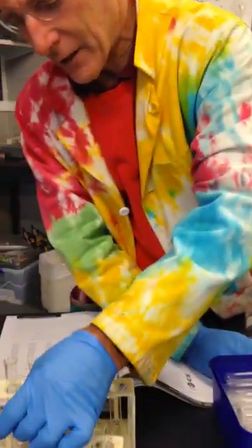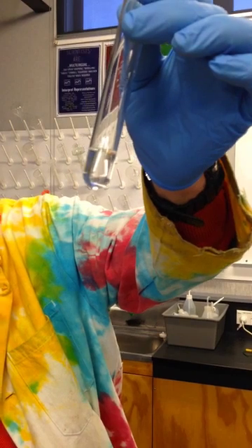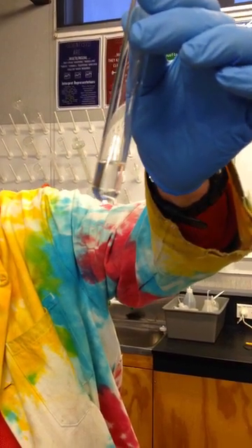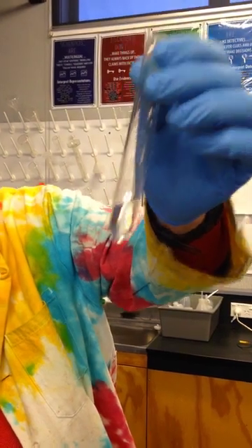The anomaly here is the ethanol. Now, why did we not get two layers here in the ethanol? And try and explain that in terms of the bonding and properties of these substances.